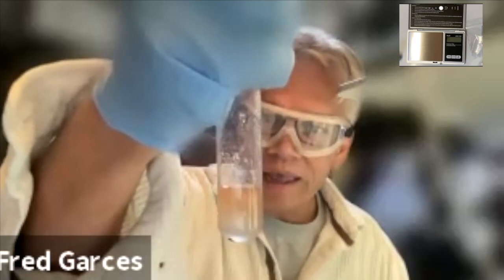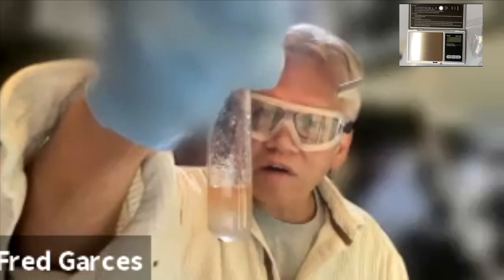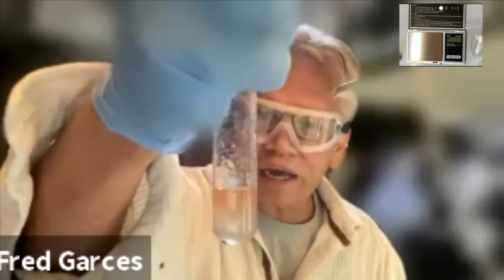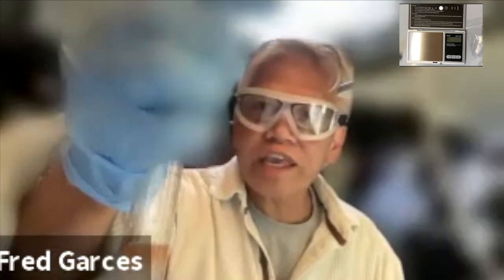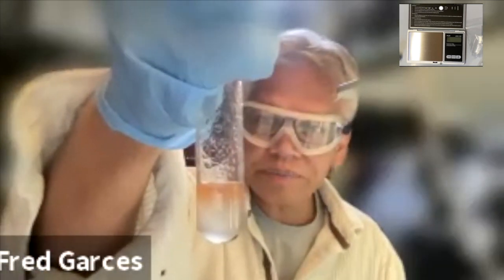Okay. And then the liquid that dissolves the iodine will be purple. The liquid that doesn't dissolve the iodine will be clear. So you just have to let it sit for a while after shaking it up, because there's going to be a whole bunch of bubbles.